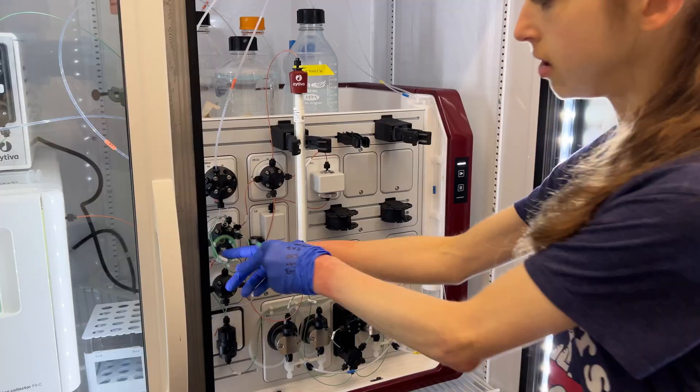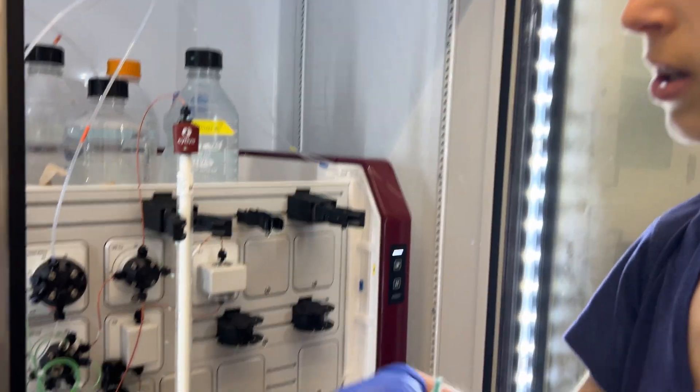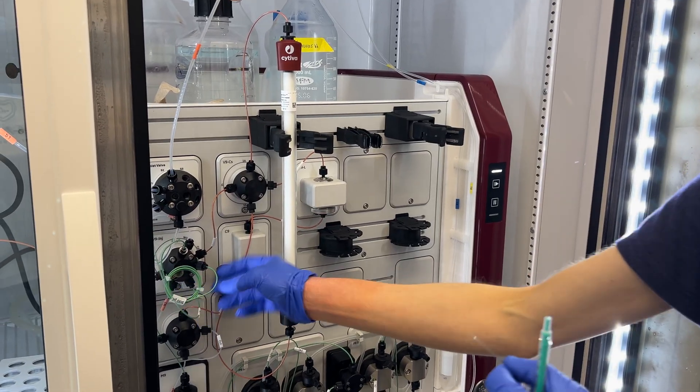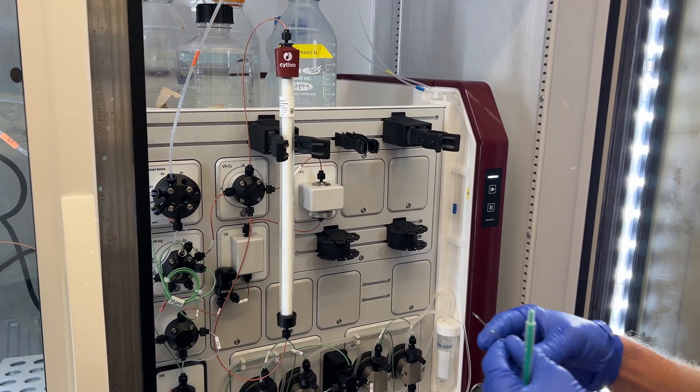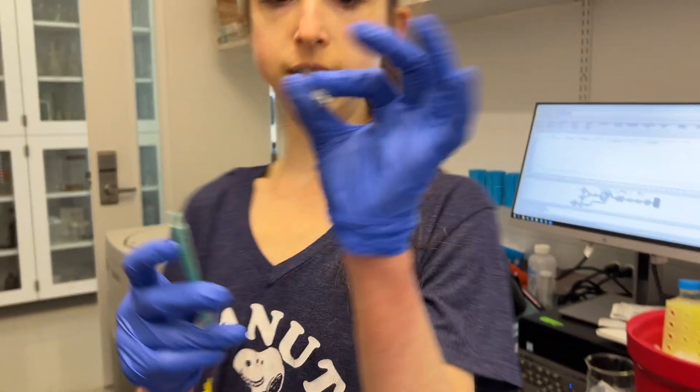We're going to inject it into this port, but we need to make sure that the needle's clean, we need to make sure that the loop is clean, and that the loop is filled with the buffer that we want. So what we're first going to do is just wash the needle.